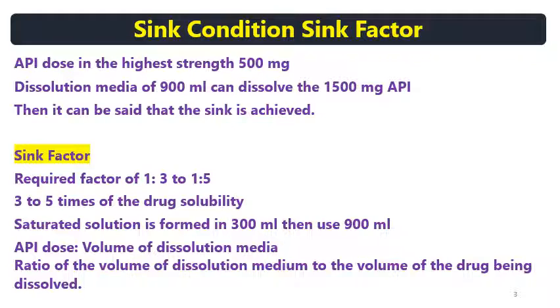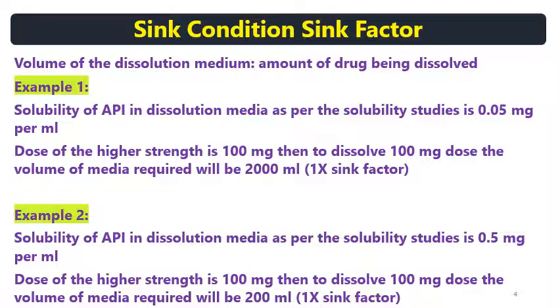So this is the simple meaning of sink factor. It is a ratio of the volume of dissolution medium to the volume required to dissolve the drug being tested, that is, the volume of the dissolution media to the amount of drug in the formulation of highest strength being dissolved. Here I have included some examples.